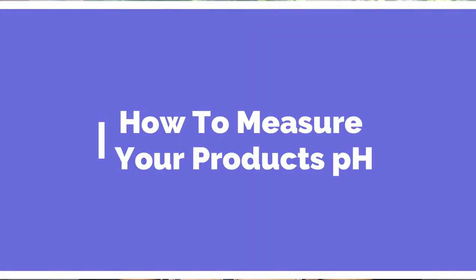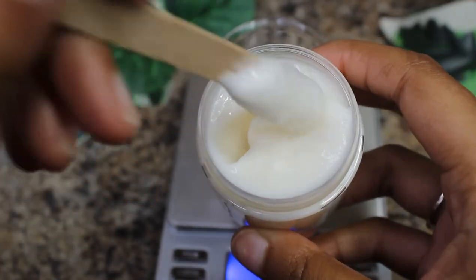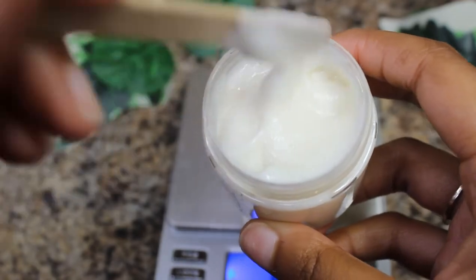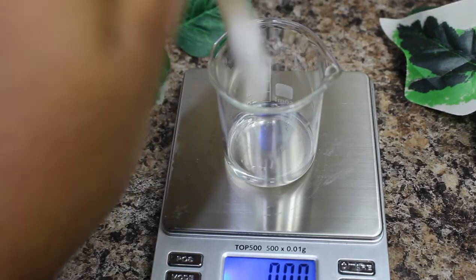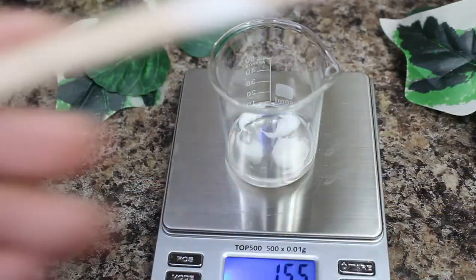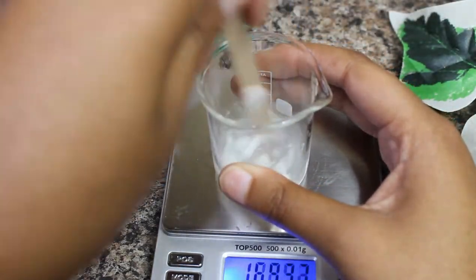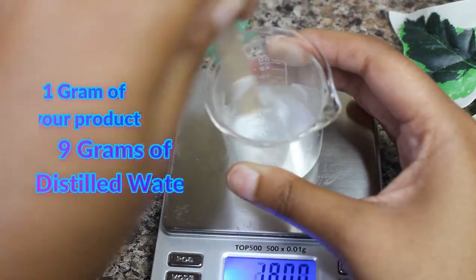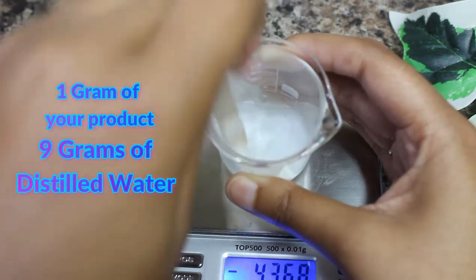How to measure your product's pH. Step one: take a sample of your product and transfer it into a clean and disinfected beaker. Make more than you think you need — for example, if you want to make an 80-gram batch of hair gel but also need to test the pH, make a 90 or 100-gram batch. pH measurement uses around one to five grams, so product isn't wasted.